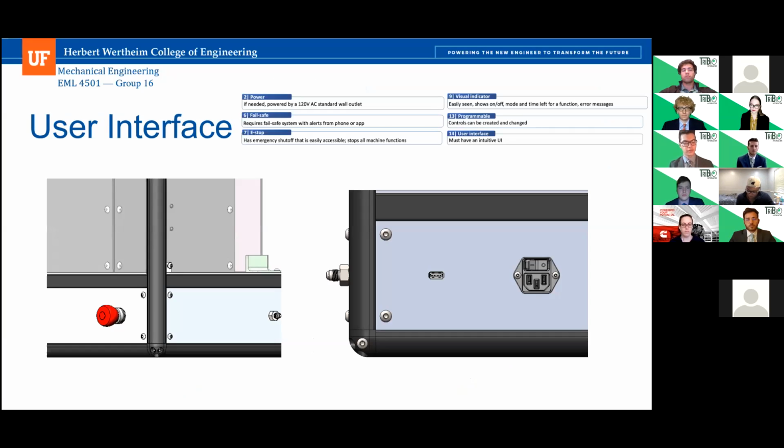And on the front of the device, we have an emergency stop button, similar to the ones used in CNC machines. You must twist and push this button to stop all operations within the device. This was done so that no one accidentally bumps into the button and stops the machine accidentally within the laboratory. We also have an AC to DC converter within the machine, allowing us to operate out of a standard 120 volt outlet. And a Raspberry Pi is used to handle the computing and closed loop control of the entire system.